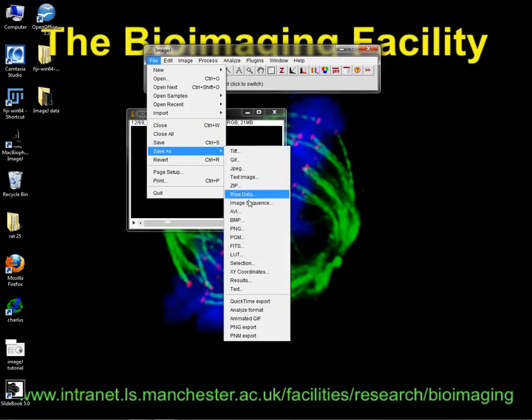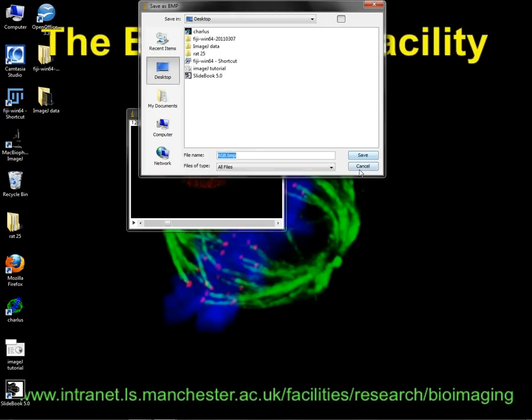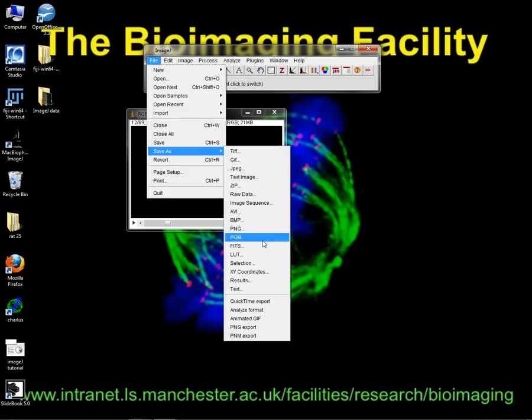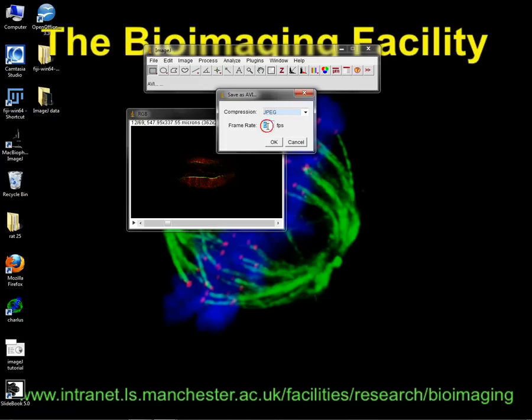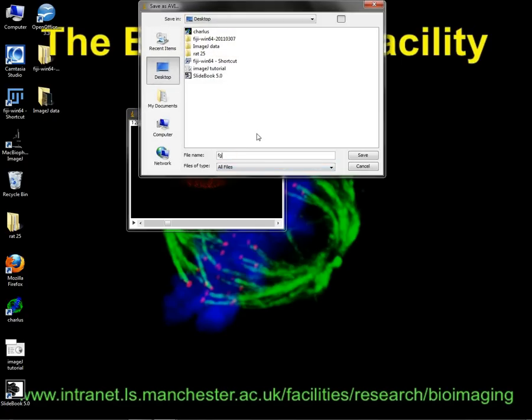Save as AVI. So you can just save off whatever you're doing, your Z stacks. Whoops, I just saved that as a BMP. Save as an AVI. How fast you want it to play? Well, let's do it 10 frames a second. Compression, uncompressed. Save it as that.